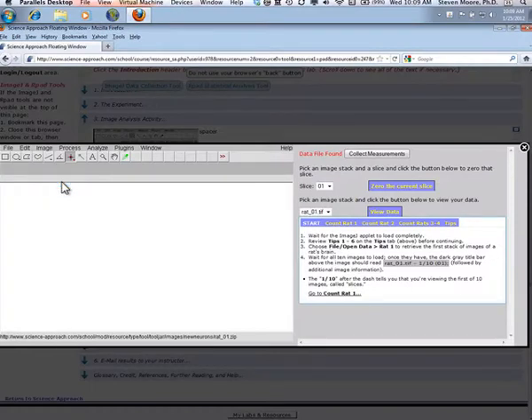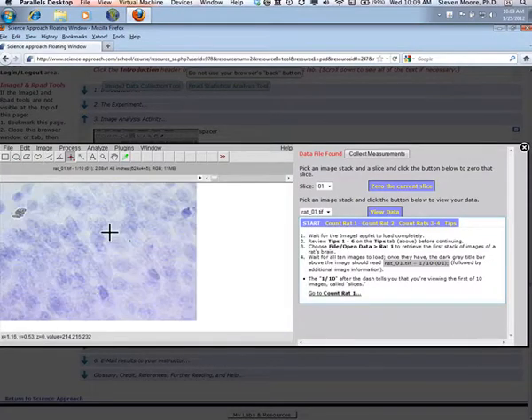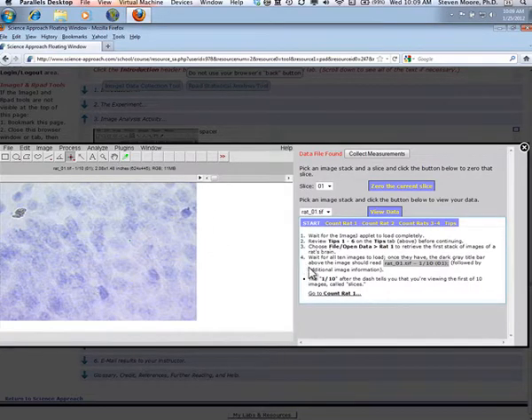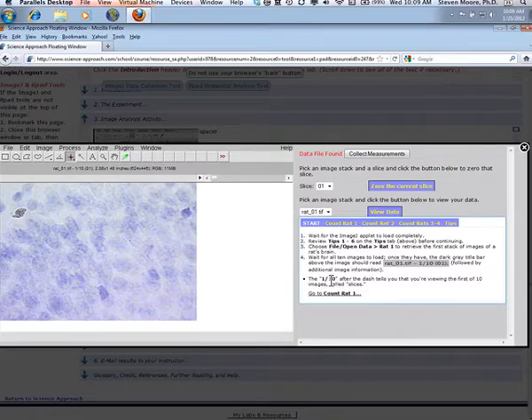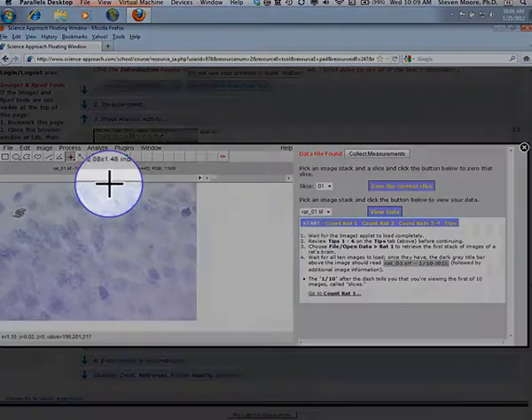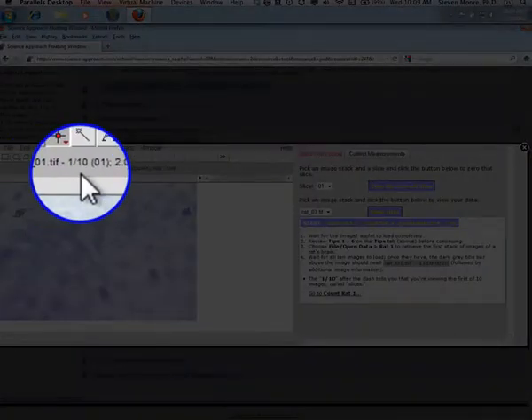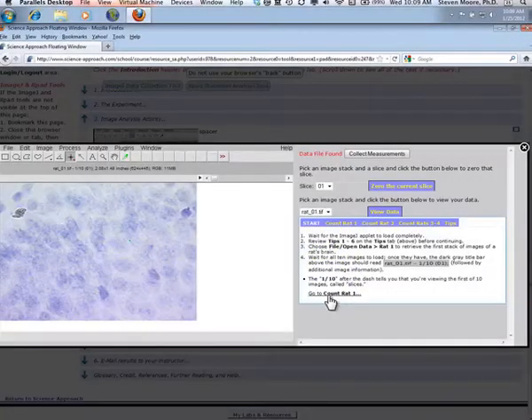To start, choose File, Open Data, and then Rat1 to retrieve the first stack of images of a rat's brain. Depending on your connection, the images may take a few moments to load. The slice number is provided in the information in the header above the image.